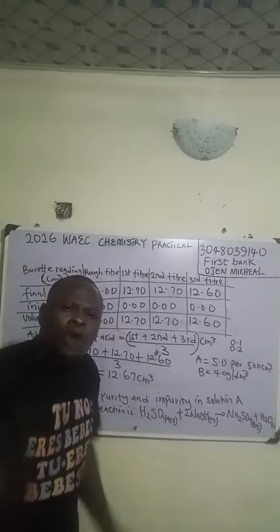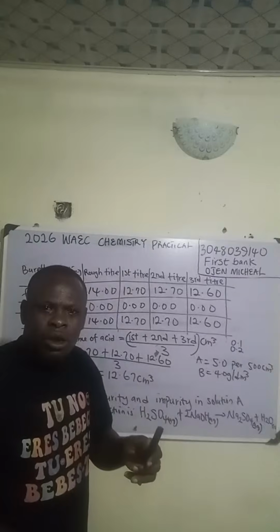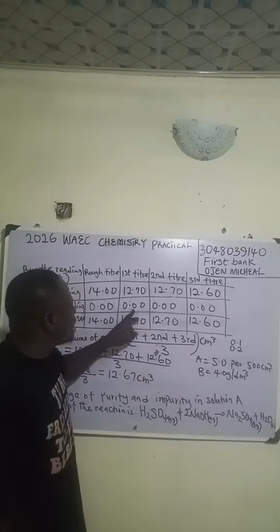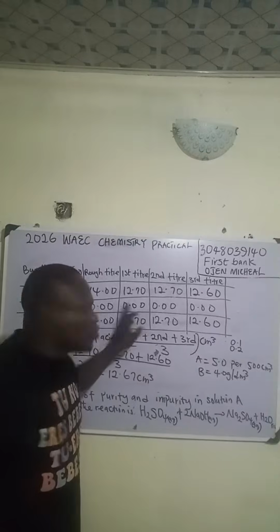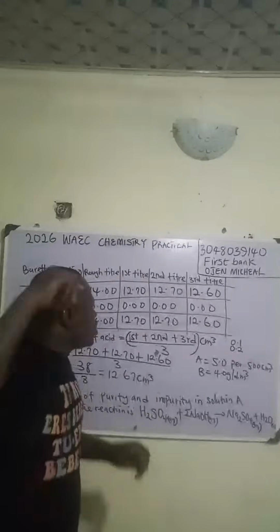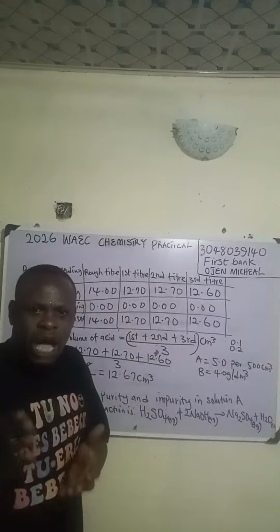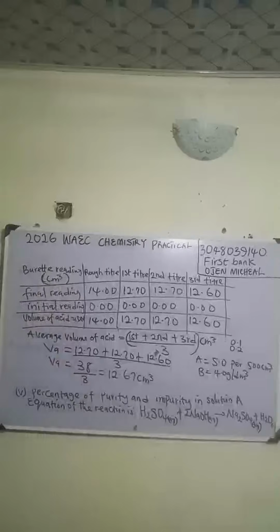There is no point in refilling the acid since there is still acid there. Ideally, this 14.00 would have been the initial of the second, but I didn't want to confuse you. If you check the real video on my YouTube channel, you can search how to perform titration. All this is explained there. Can we proceed?